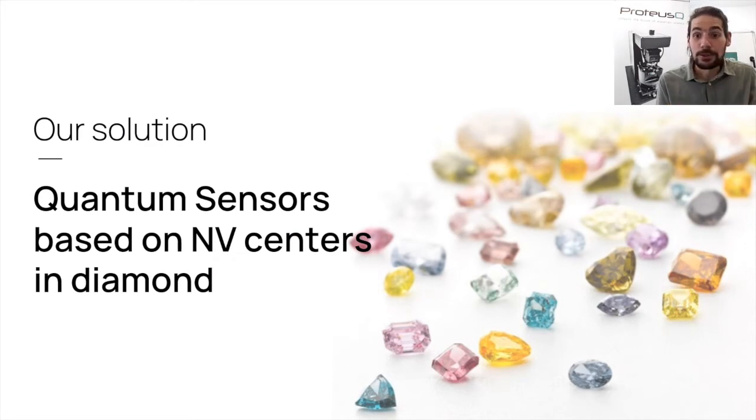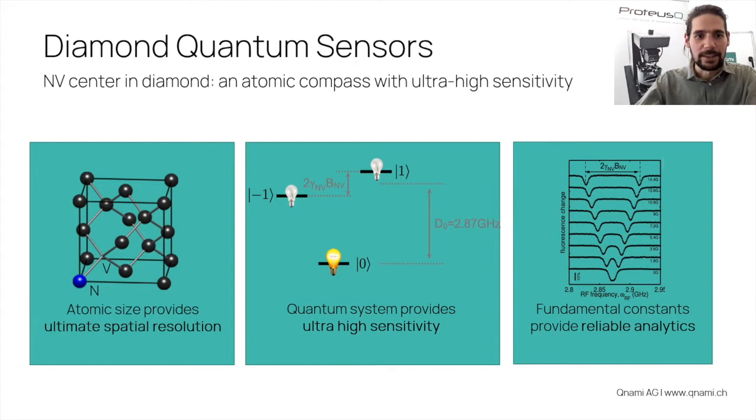Our solution to resolve these small magnetic fields is to use quantum sensors based on NV centers in diamond. These NV centers, or NV defects, give the color to the diamond. So what is this color center? If you look at the crystal structure of diamond, there's one carbon atom replaced by a nitrogen atom, and next to it is a vacancy. This NV center can capture an electron and then forms an interesting level structure.